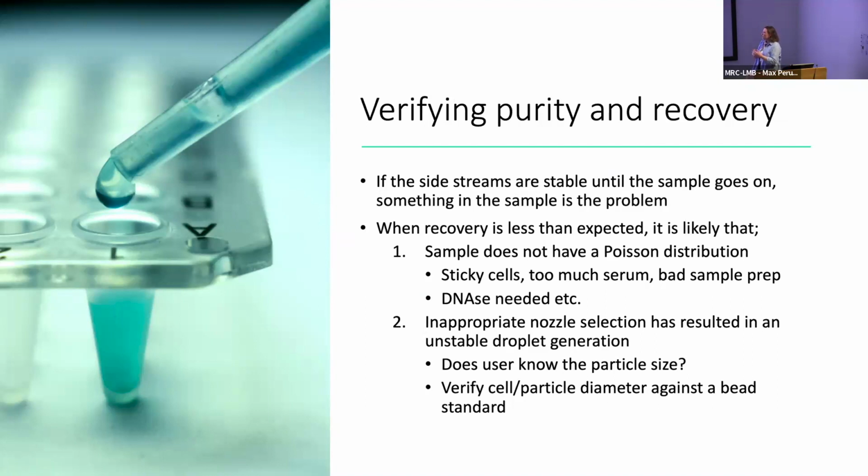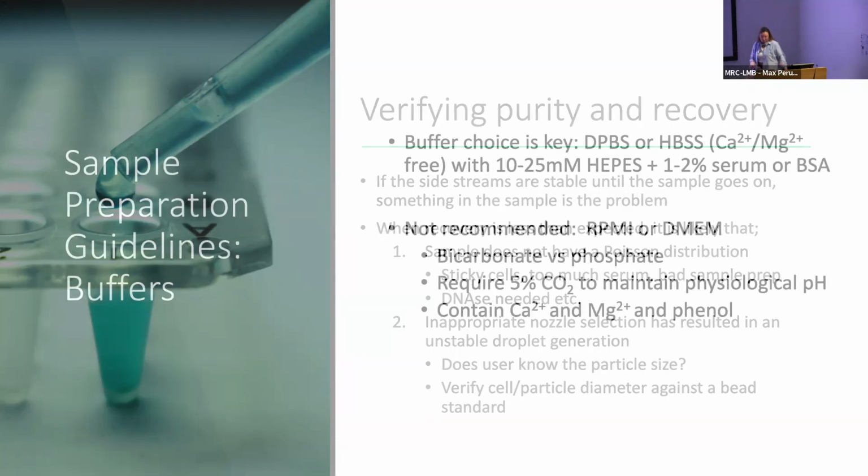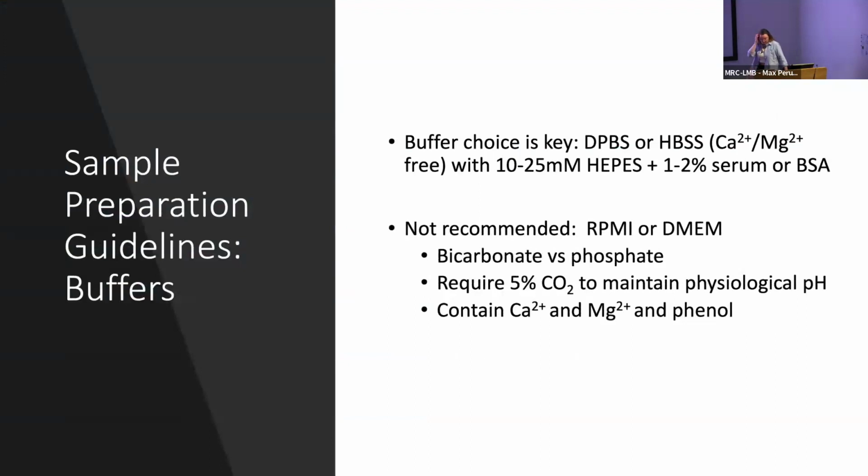Dial down the concentration, filter your cells. All of these things will mitigate those problems. And again, getting back to the more you know about your cells in advance, the morphology, the expected size, the better we can guide you to the correct machine, knowing what settings we're going to use to maximize your results downstream. All right, so a little bit about sample preparation guidelines.